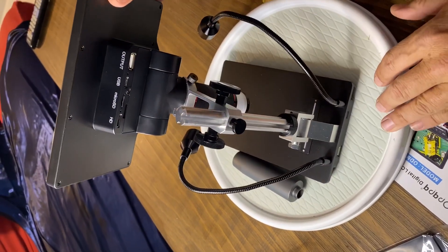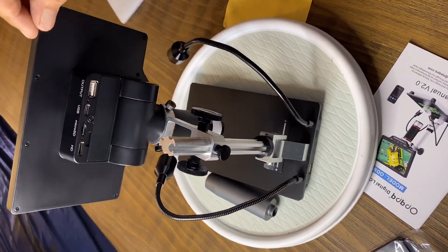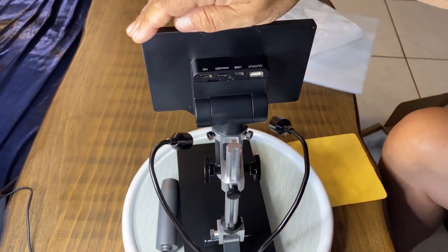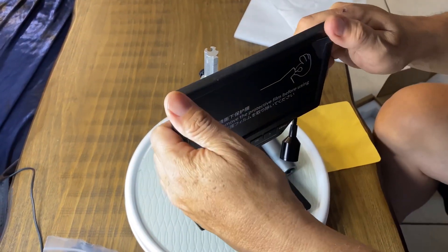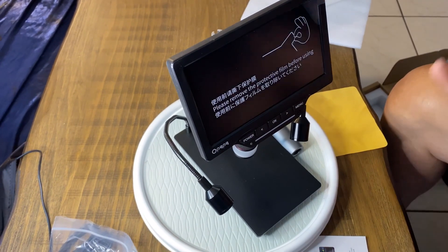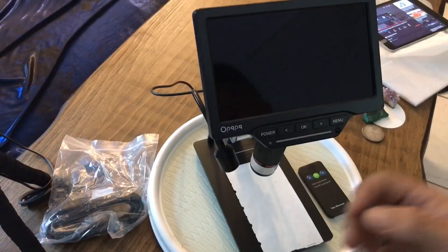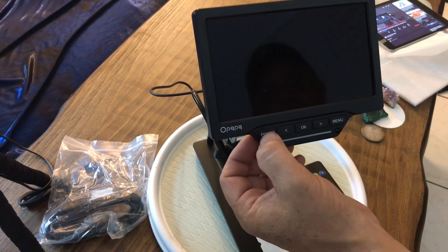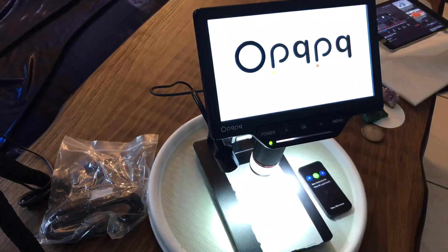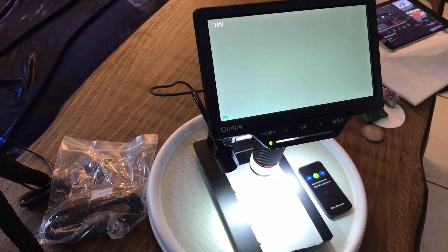Here's all the ports on the back. Oh, it already has a card in it — it came with a card. It's got HDMI out so you can go straight out to your TV. In a few minutes we'll show a video of it all hooked up and powered up. I've gone through the manual a little bit; let's see how easy this is to use. Hold the power button so it turns on. This is their 7-inch version and it's a nice little unit.